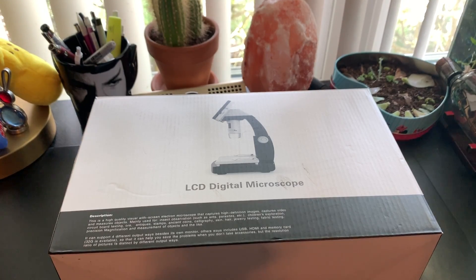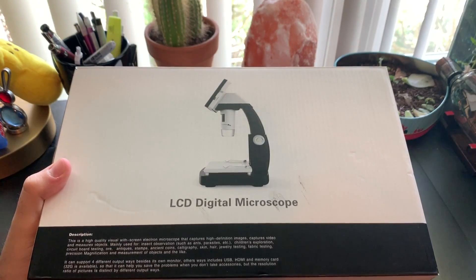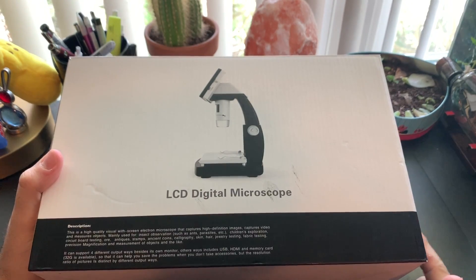What is up everybody, it's Napalmic Acid. Today I'm going to be checking out this Foklyn LCD digital microscope right here. You can pick this up on Amazon for about $99 and there will be a link down below if you want to purchase it.